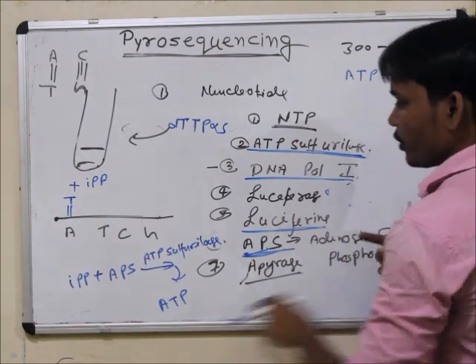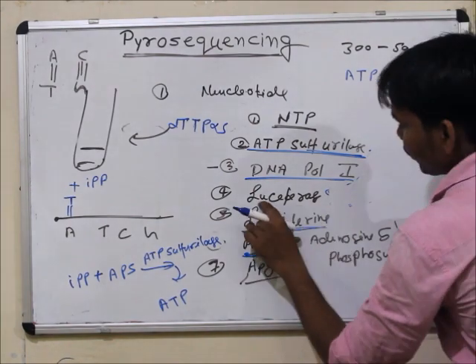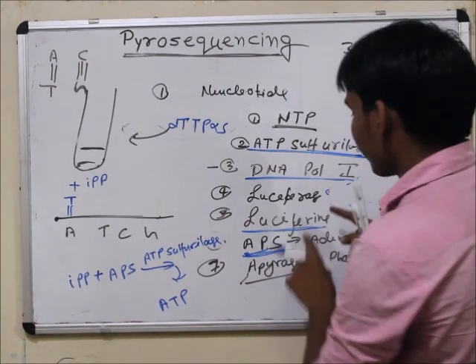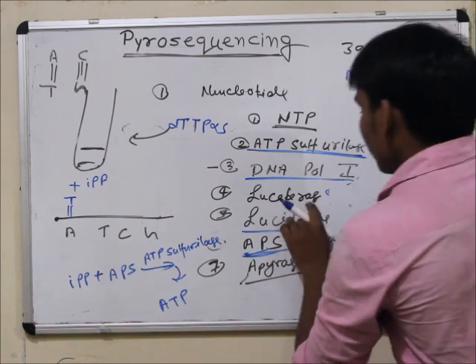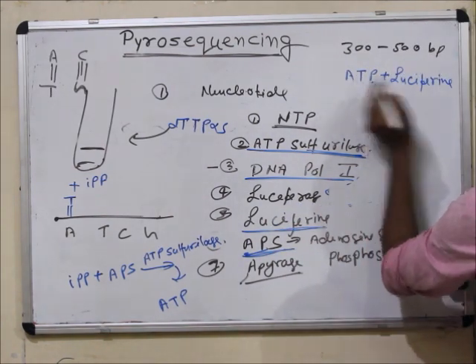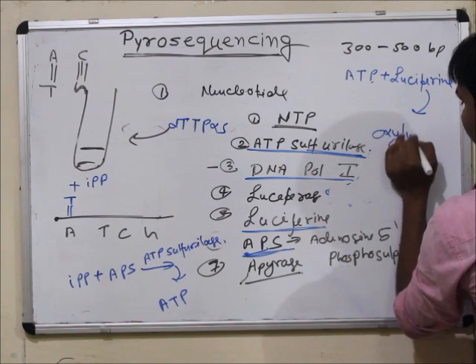Again then, there is the remaining activity of luciferase and luciferin. Luciferin plus ATP is converted into oxyluciferin.